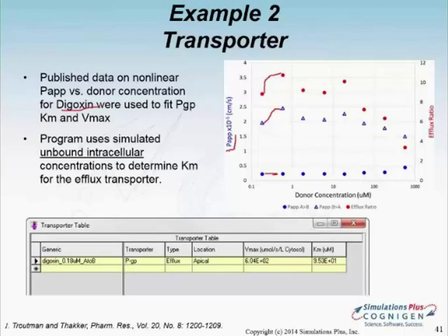But that may be one of the aspects why we had to incorporate some additional parameters into the model other than just the log P or log D.